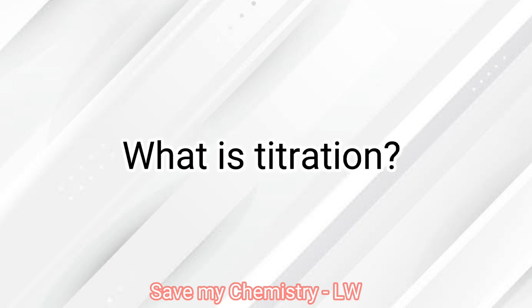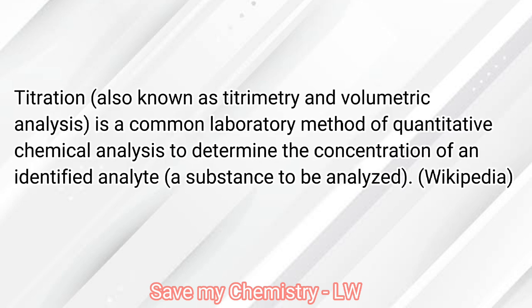What is titration? Titration, also known as titrimetry or volumetric analysis, is a common laboratory method of quantitative chemical analysis to determine the concentration of an identified analyte, or a substance to be analyzed.